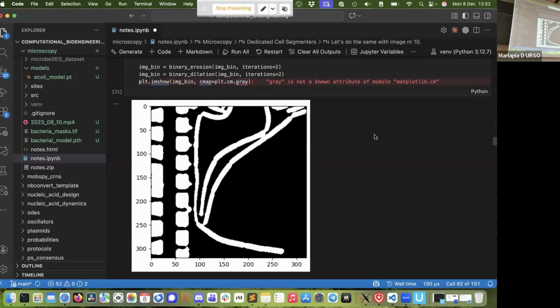but one after the other. Let's apply first our watershed algorithm. Like we were quite proud of the watershed algorithm, right? Let's apply that to this image. So this is the best threshold we find. I mean, you have to trust me. I played around a bit. Doesn't get any much better.